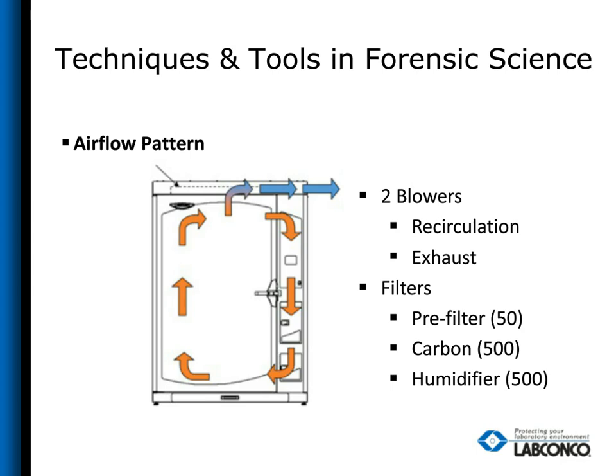When we're using an automated system, the exhaust actually turns on and doesn't require the end user to be standing there. They work good until they stop. And not knowing the proper amount of glue to put in your tin, the volume of your chamber, and how your exhaust works, this actually leads to overfuming and damaging of evidence.